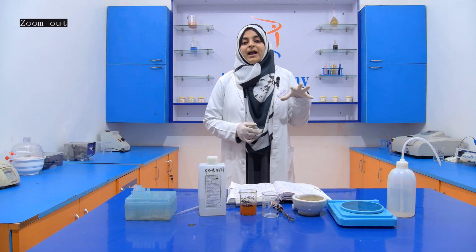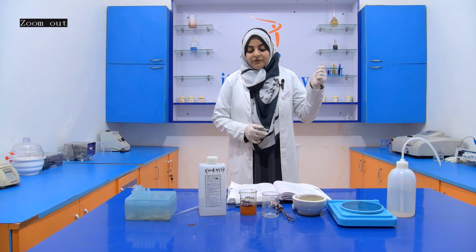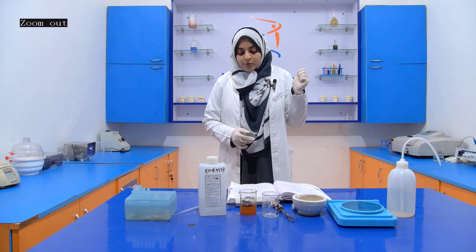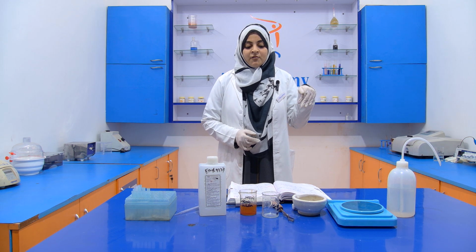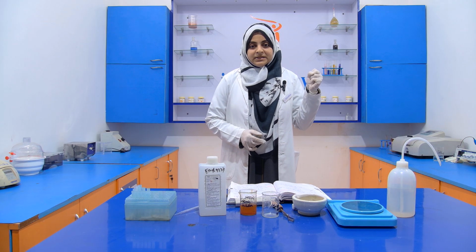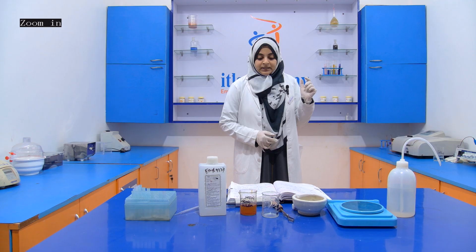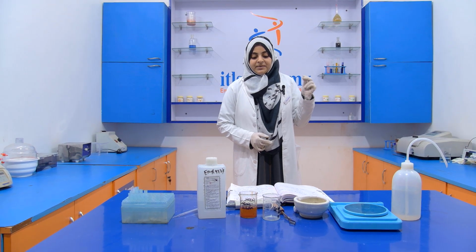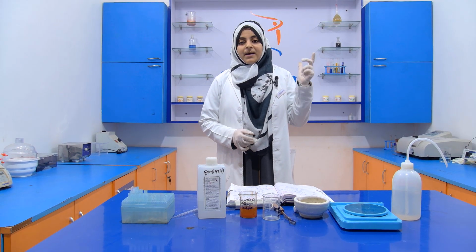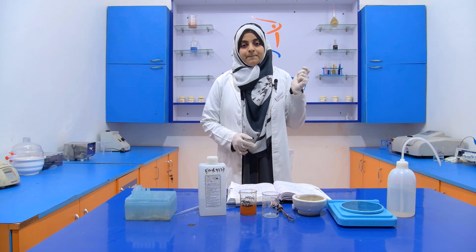Then we take it out with the help of a spoon and cut the black pepper into halves using a mortar and pestle, and into it we add this iodine solution. If we get a pale color, it means it is adulterated with papaya, and if we get a blue color, it means starch is present.